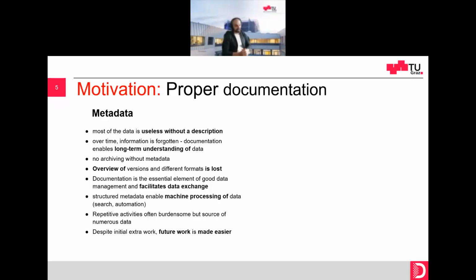It can be burdensome, but it is also the source of numerous data, and often something that is really the base to build upon. Especially, and I want to highlight this here, when you want to go in the way of machine learning or machine processability of data.